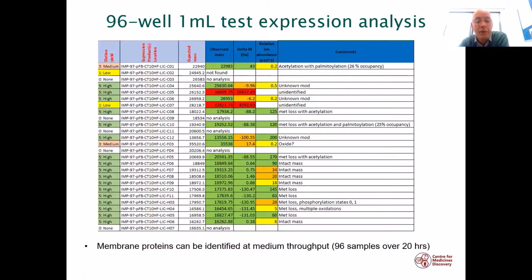So we can identify membrane proteins, we can check that we have the correct construct, we can see if there are any post-translational modifications, and we can do this, I would describe, in medium throughput. So this analysis was done over 20 hours.